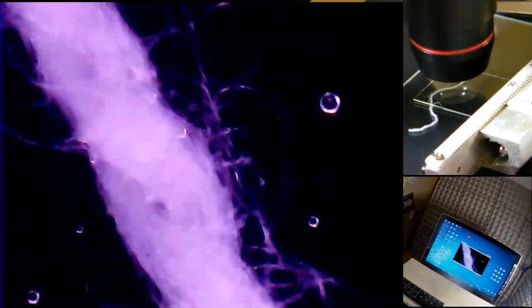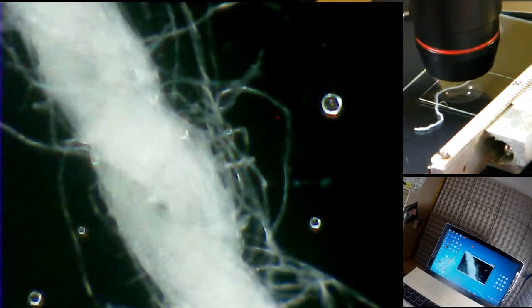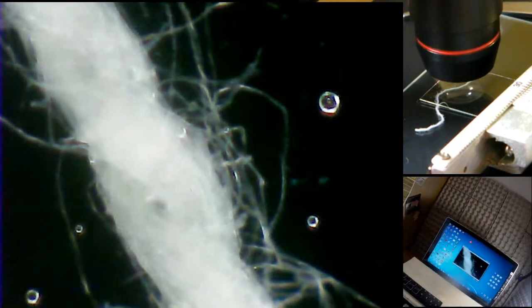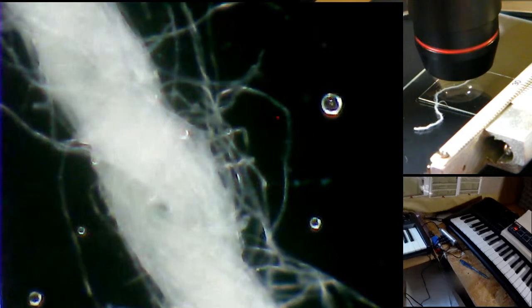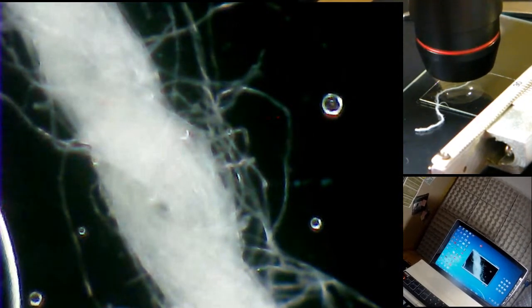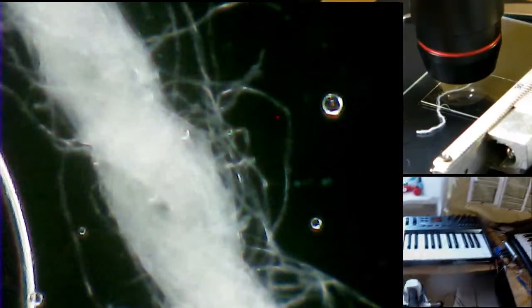Alright, let's try once again different filters. Ah, yeah. Oh, no, not yet. I thought it was. What about different lights? Now, this wheel, the filter wheel, is exactly between two filters, so no light is coming down, coming through the lenses. Now it's the light only coming from above.